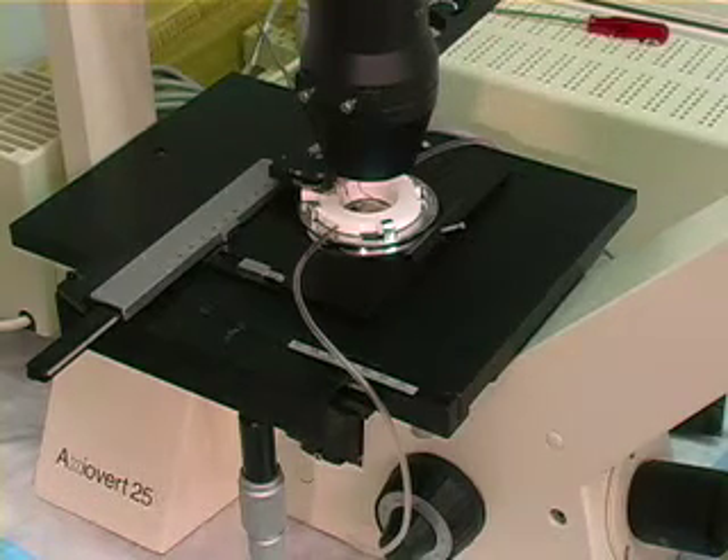The system is made of a microaqueduct slide, which is the heart of the system, a top of the chamber which has the perfusion ports and the ability to apply and remove media throughout the chamber, and a heated base.